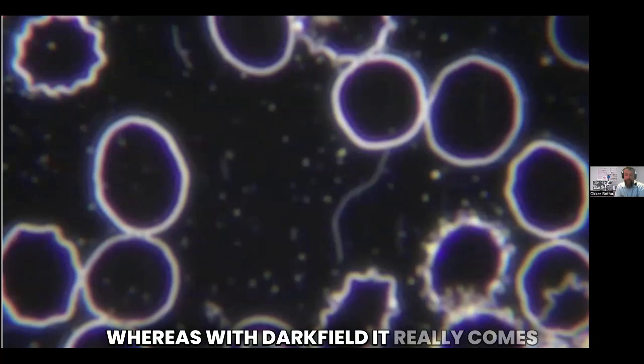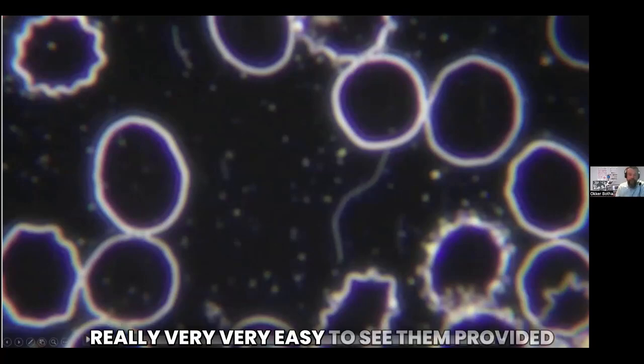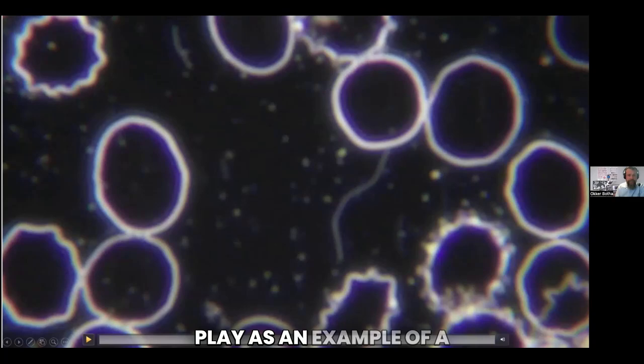Whereas with dark field, it really comes alive and becomes very, very easy to see them, provided, of course, that you have a good system. So we have a video here that I can just play as an example of a cell wall deficient bacteria.